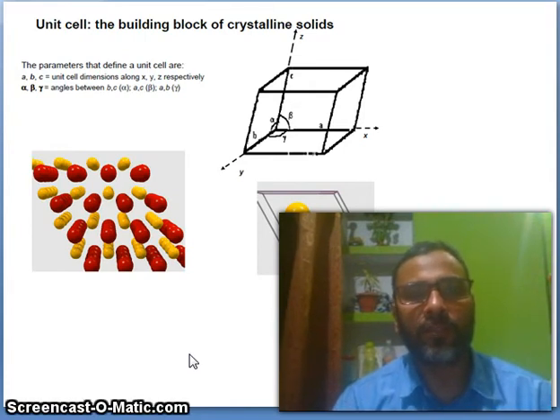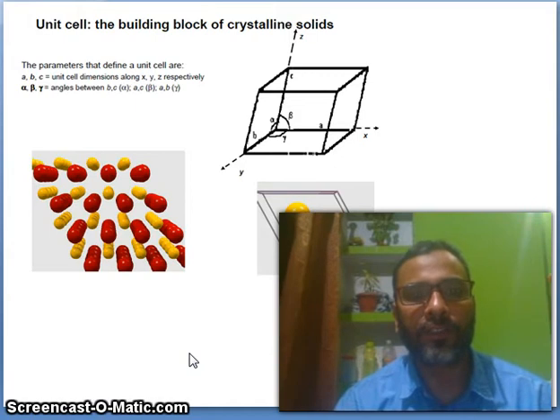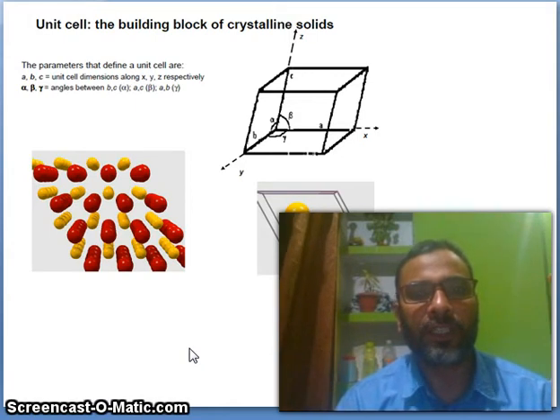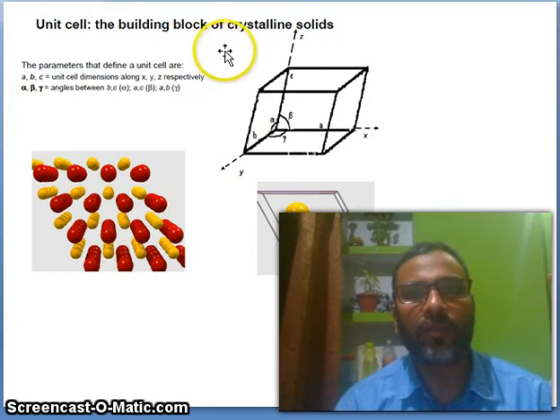Today in this video I am going to explain about crystal, single crystal X-ray diffraction. So let us start with the basic unit cell, the building block of crystalline solid.